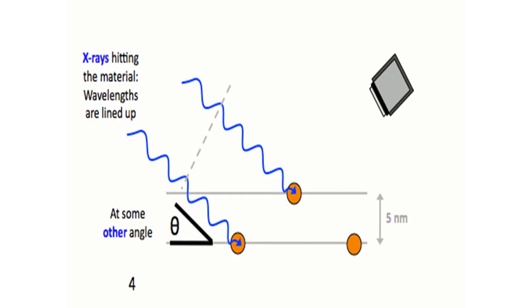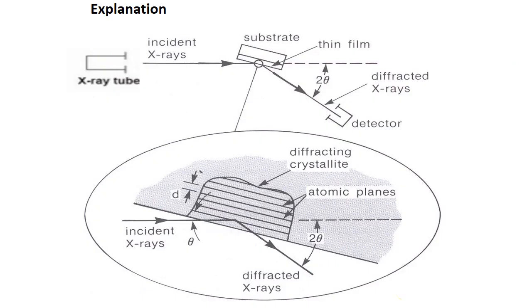Here is the diagram showing the diffraction pattern. Explanation. Diffraction techniques, particularly those using X-rays, are the most important methods. The X-ray diffraction technique has been used to determine the structures of 250,000 different substances, including tens of thousands of purely inorganic compounds and many organometallic compounds.